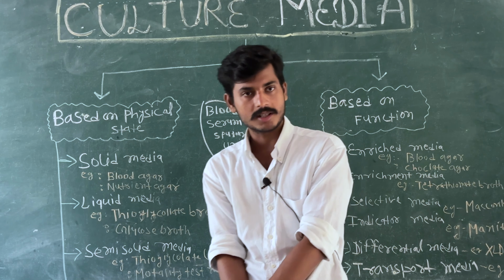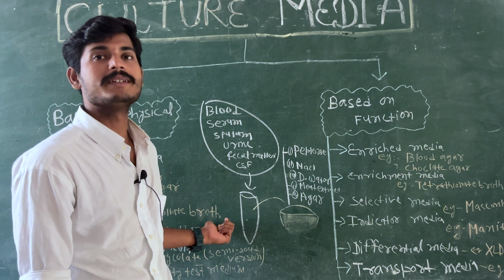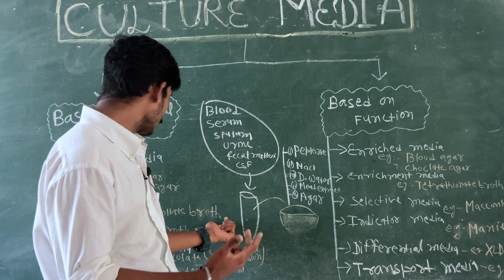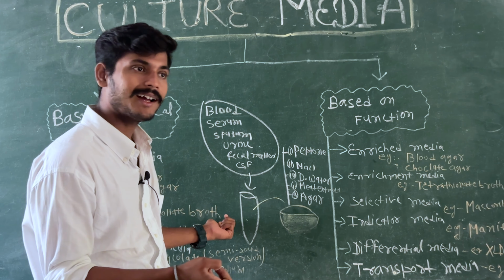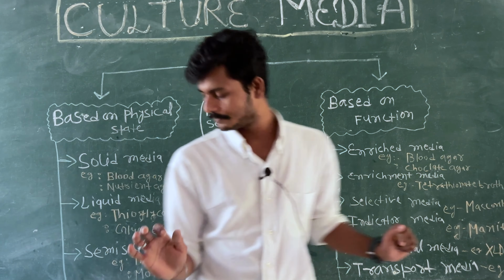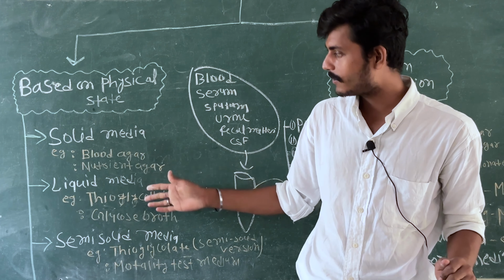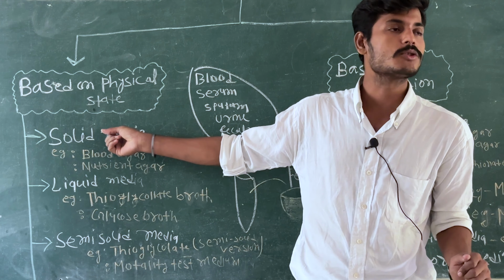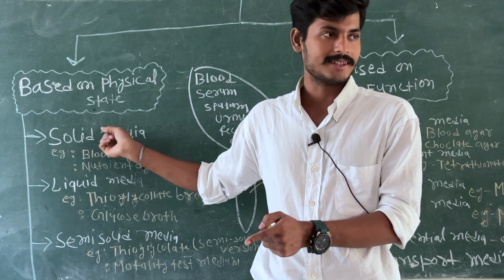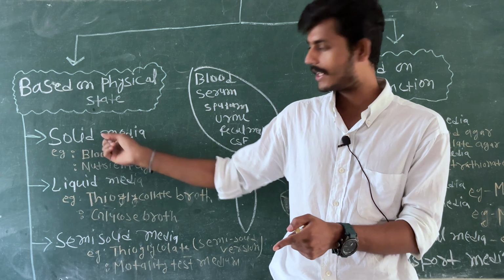एंड वन थिंग यू जस्ट रिमेंबर, कीप इन योर माइंड, इज दैट इन द माइक्रोबायोलॉजी broth means liquid. So either we can use the thioglycollate liquid media or thioglycollate broth media. No problem. Coming to the semi-solid media, and these all have the different use. Solid media is used for understanding the bacterial shape and size. Okay? Solid media is used for the shape and size.